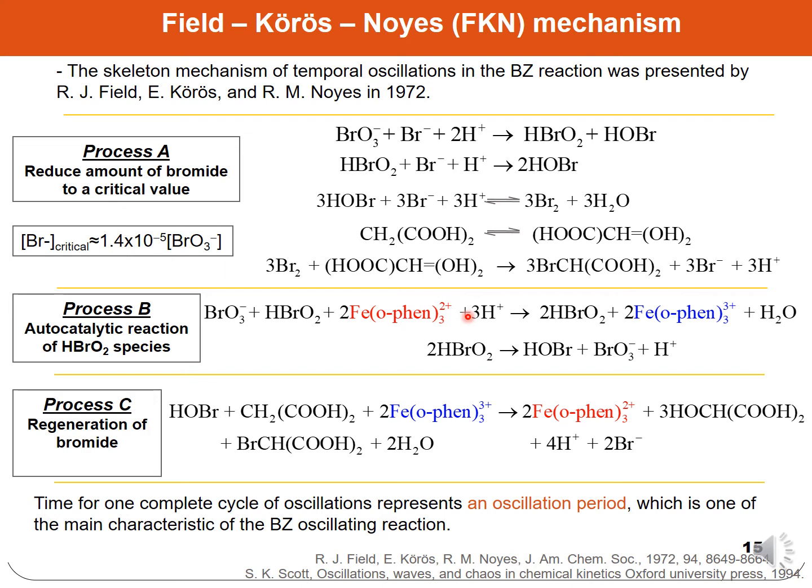So when we add ethanol, it can decrease the oscillation period. Imagine that the oscillation period is one cycle: A, B, C, back to A again. We have reviewed the literature showing that ethanol can react with bromate.